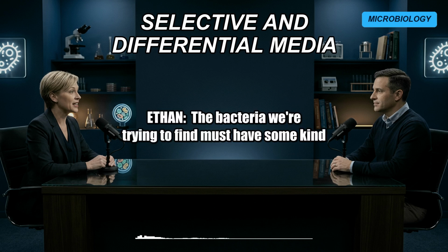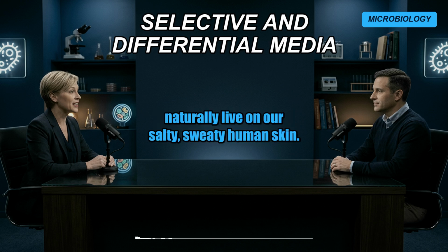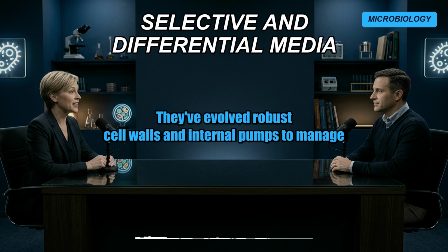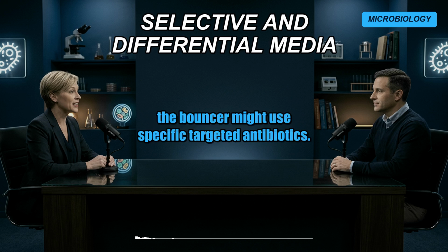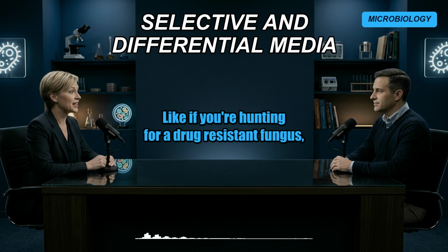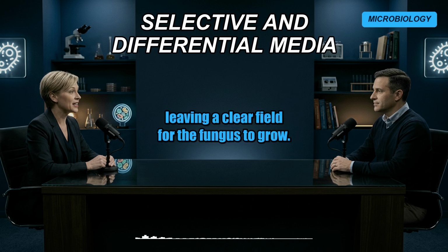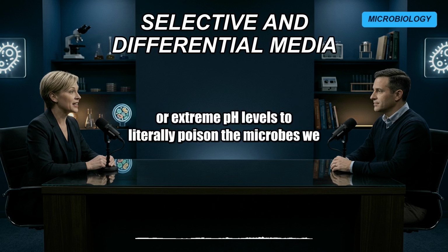But the bacteria we're trying to find must have some kind of armor against that, right? They do. Staphylococcus species, for example, naturally live on our salty, sweaty human skin. They've evolved robust cell walls and internal pumps to manage extreme salinity. So while everything else shrivels, staph thrives. That is so smart. Alternatively, the bouncer might use specific targeted antibiotics. Like if you're hunting for a drug-resistant fungus, you might lace the jelly with penicillin to wipe out all the competing bacteria, leaving a clear field for the fungus to grow. So the bouncer uses salt, antibiotics, or extreme pH levels to literally poison the microbes we don't care about.